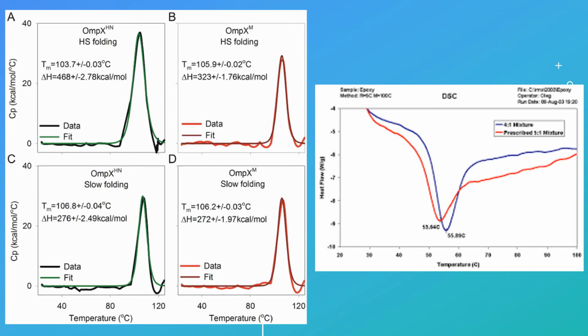As you can see in the picture, this is an example of the data we can gather from a differential scanning calorimeter, and the peaks there show you where the crystallization or melting point of the sample is, in terms of the temperature and the change of heat flow.